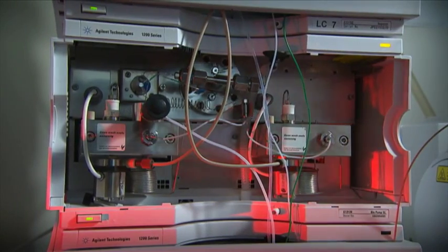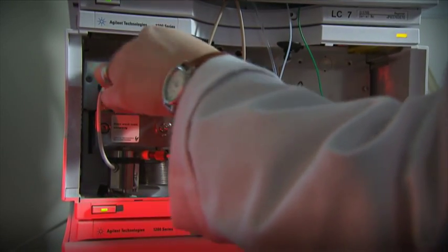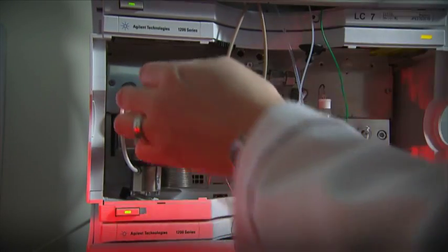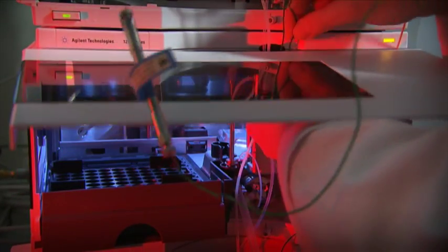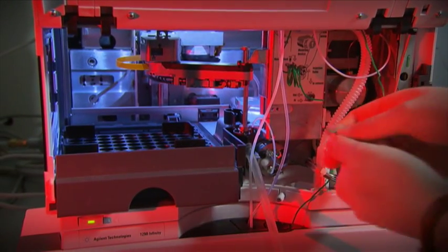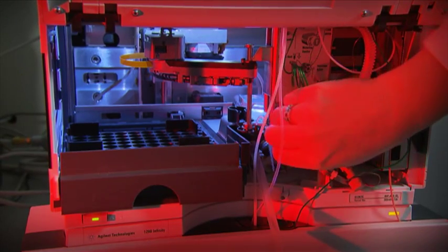We need to prevent any PFCs which may have originated in the HPLC system from interfering with your target compounds. So we put an extra column between the pump and the injector. There are several types of suitable analytical columns, but particularly recommended are C8 and fluorinated C8 columns. The solvents used for the separation and the gradient used depend on the type and size of analytical column. These need to be optimised before starting analysis.